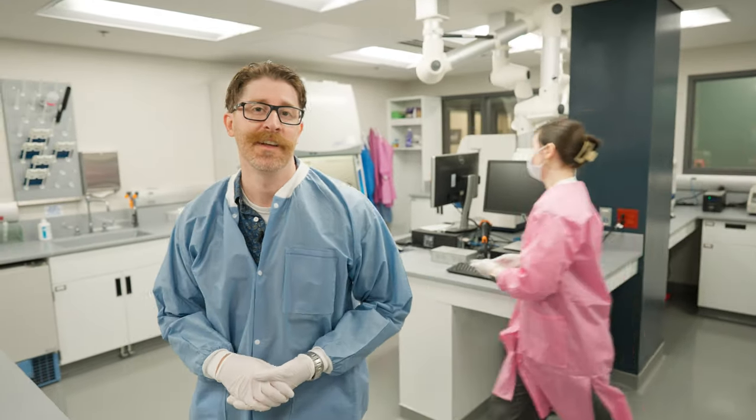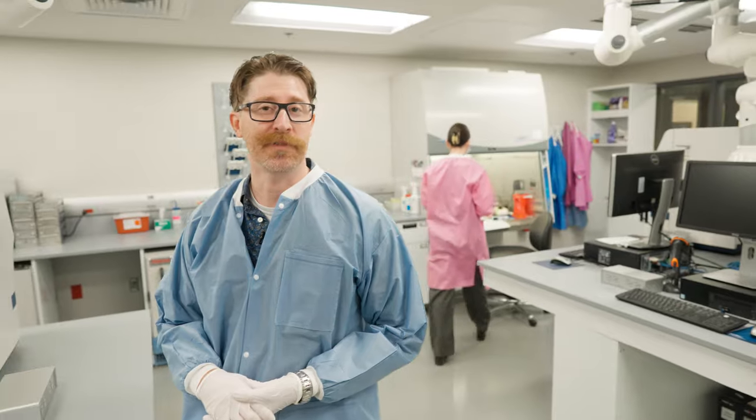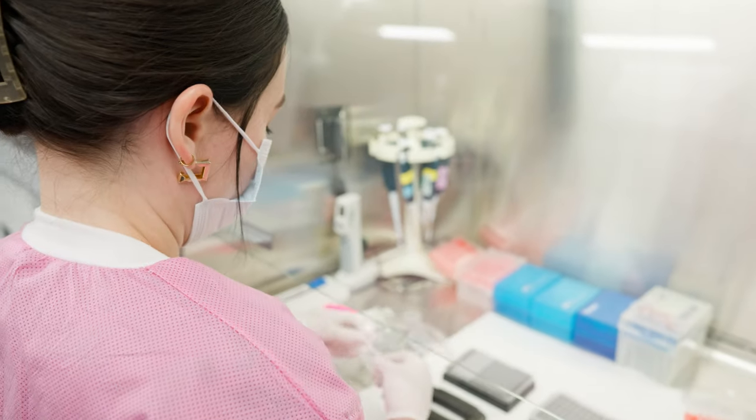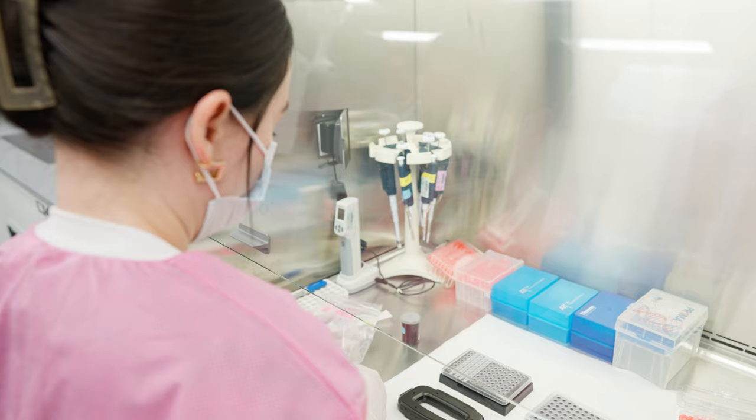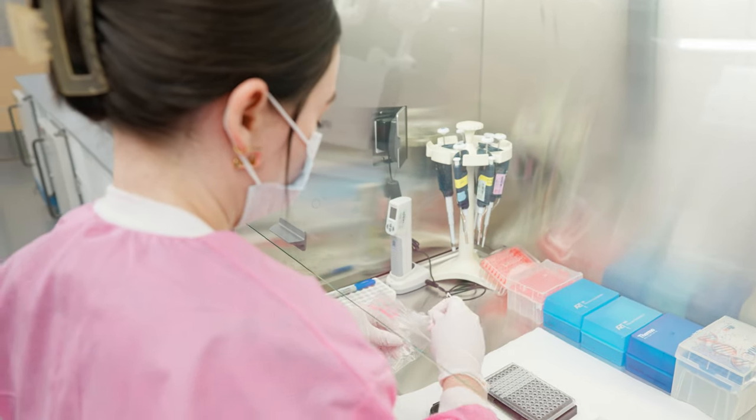The last step of the process is to detect the sample fragments that were amplified and fluorescently tagged. This process is known as capillary electrophoresis or CE. An instrument called a genetic analyzer is used to separate the DNA fragments by size as the fragments pass through the capillary.